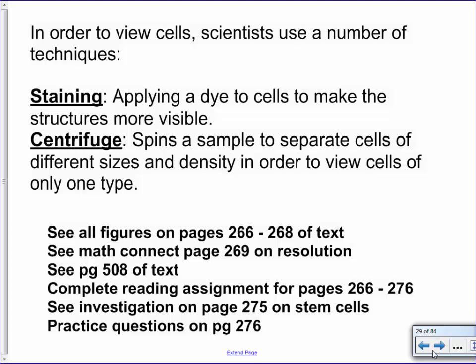And that particular chemical, basically the way it works is it dyes the substance. So if you have a clear substance that's really hard to see, it'll coat the outside edges with blue, because it's blue, right? And it'll make it just a little bit easier to see. Sometimes the term we use is contrast. Do I have that on here? I don't. Have you ever heard that word before, using like a contrast ink to try to help make things show up?